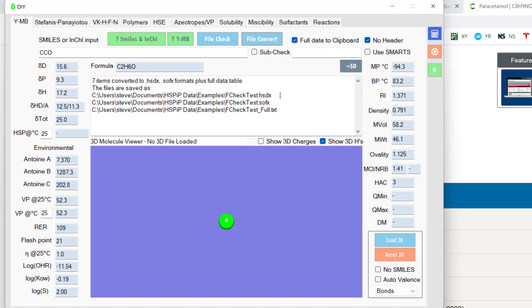Which is one of the standard formats, SOFX, which is a solvent optimizer format, and also the full data with all the estimated values. Because when you do YMB, you get the Antoine coefficients of vapor pressures and relative evaporation rates and all sorts of things automatically. And you can choose to ignore them or you can use them for your own data.